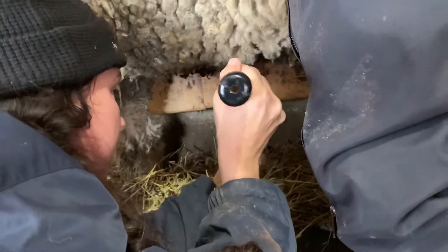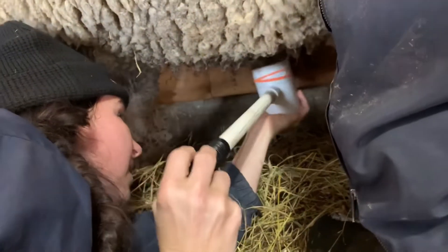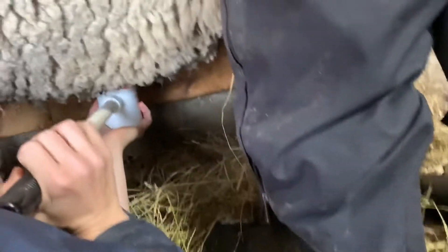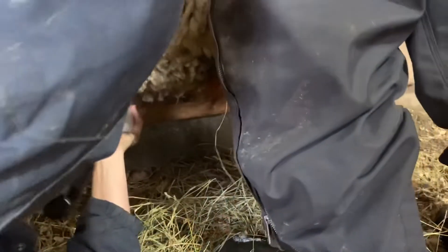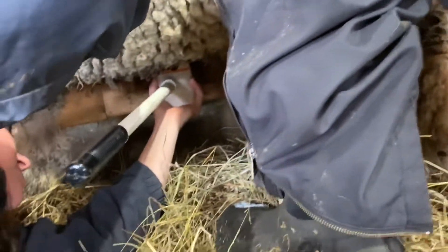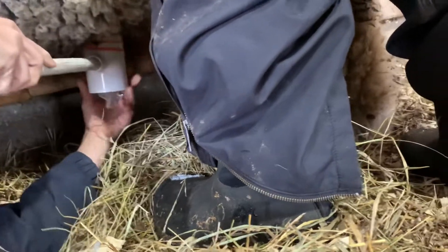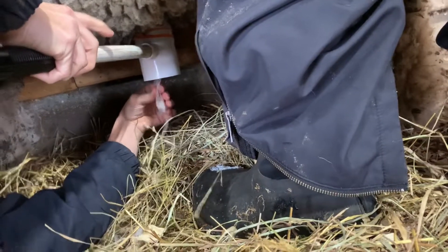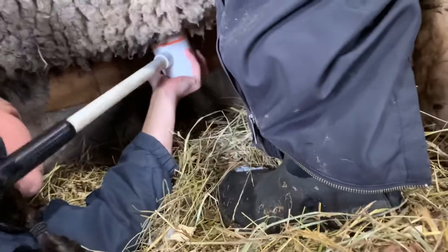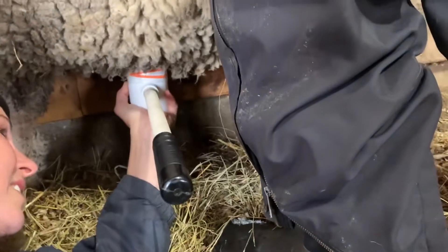I got a little bit. Hopefully we'll be able to get enough from him. There we go — there's a little bit of semen for you to see. Not as much as last time. If it has good motility, then we will hopefully have more lambs.